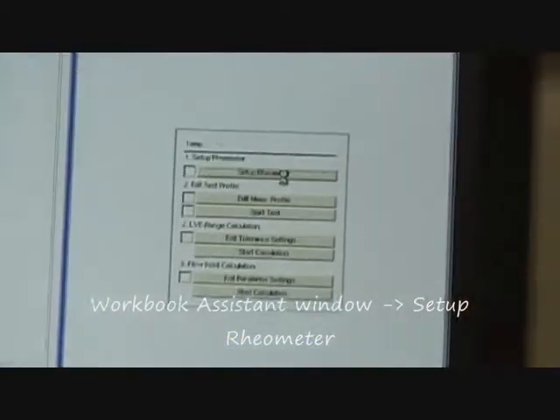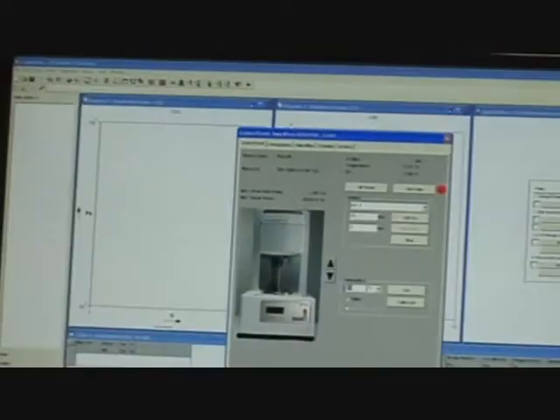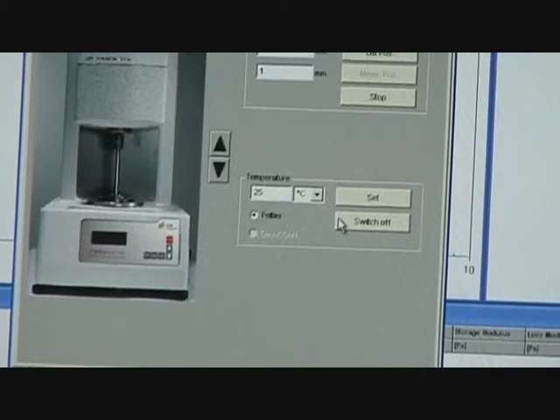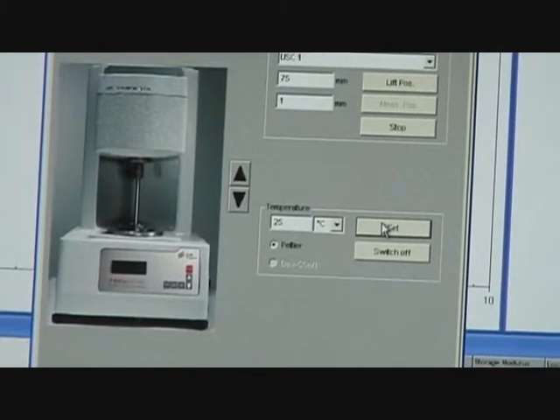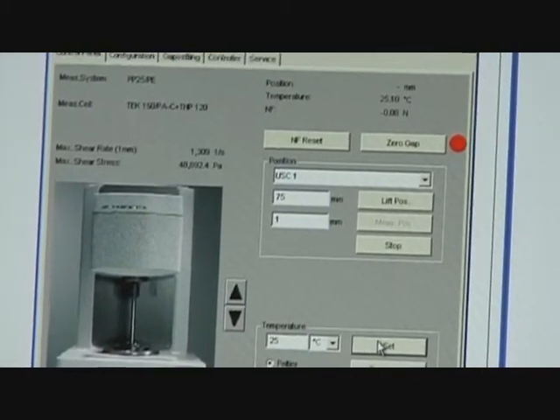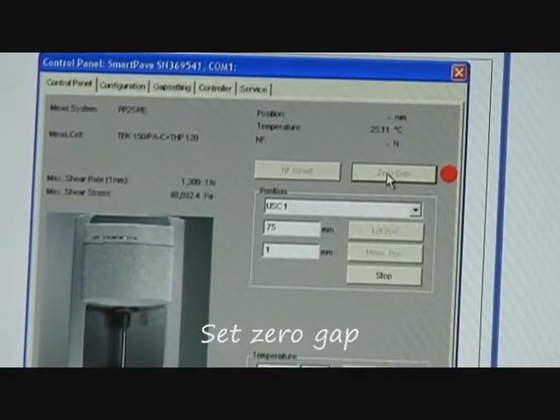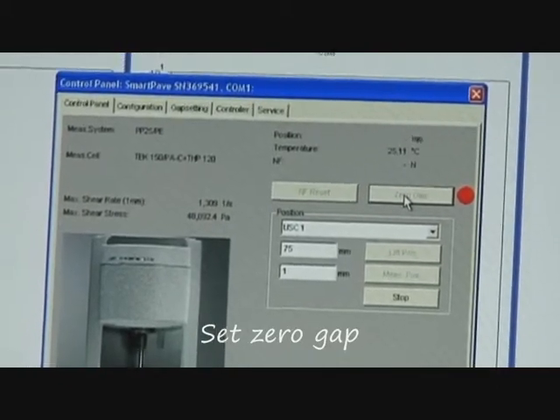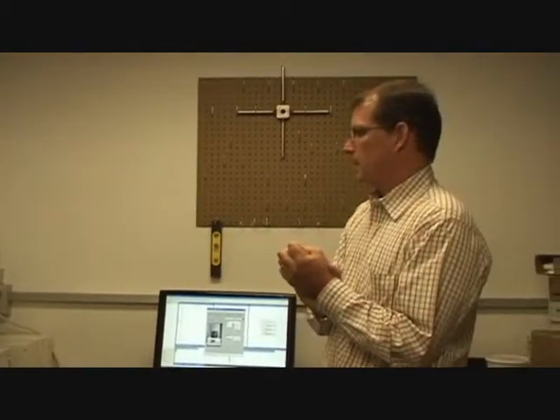First thing it says: set up rheometer — click on that. If it opens up, first thing I should do is set my zero gap. I want to run at a certain temperature — I know I want to run at 25 degrees — so I put in 25 degrees and hit Set. What that does is it turns on the Peltiers and says go up to 25 degrees. You're going to have a little trouble getting there because everything's opened up, but for right now I want to let this system equilibrate. So I hit 25 to get it started, and now I'm hitting zero gap — it's going to go down and figure out when the zero gap is.